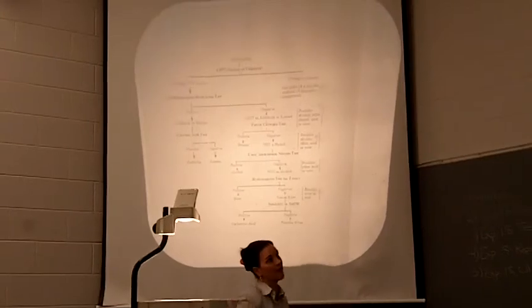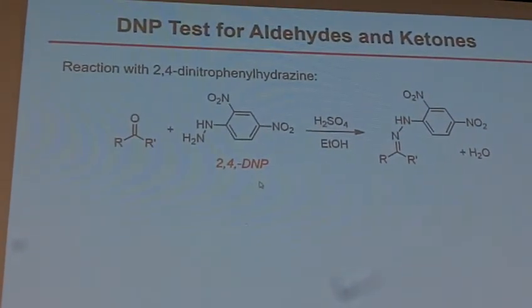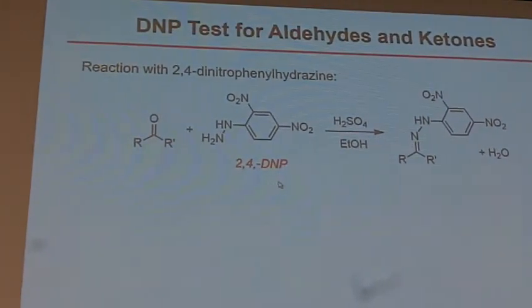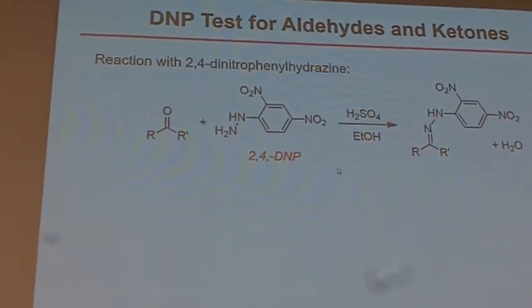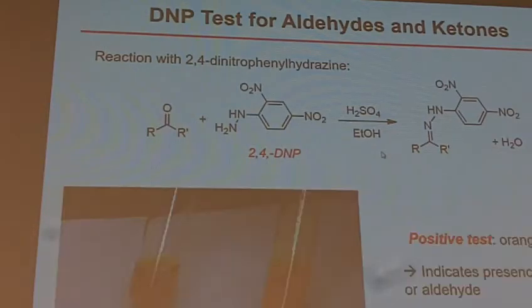And so if you recall from last semester, we were just looking at ketones; this time we're looking at ketones and aldehydes. They will react with 2,4-dinitrophenylhydrazine to give the hydrazone. And what you will see is a yellow-orange solution that then goes on to form a yellow-orange precipitate. So if you get a positive test for that, you will go on to do the chromic acid test. If you get a negative test for that, we're going to go on to the ferric chloride test, okay?